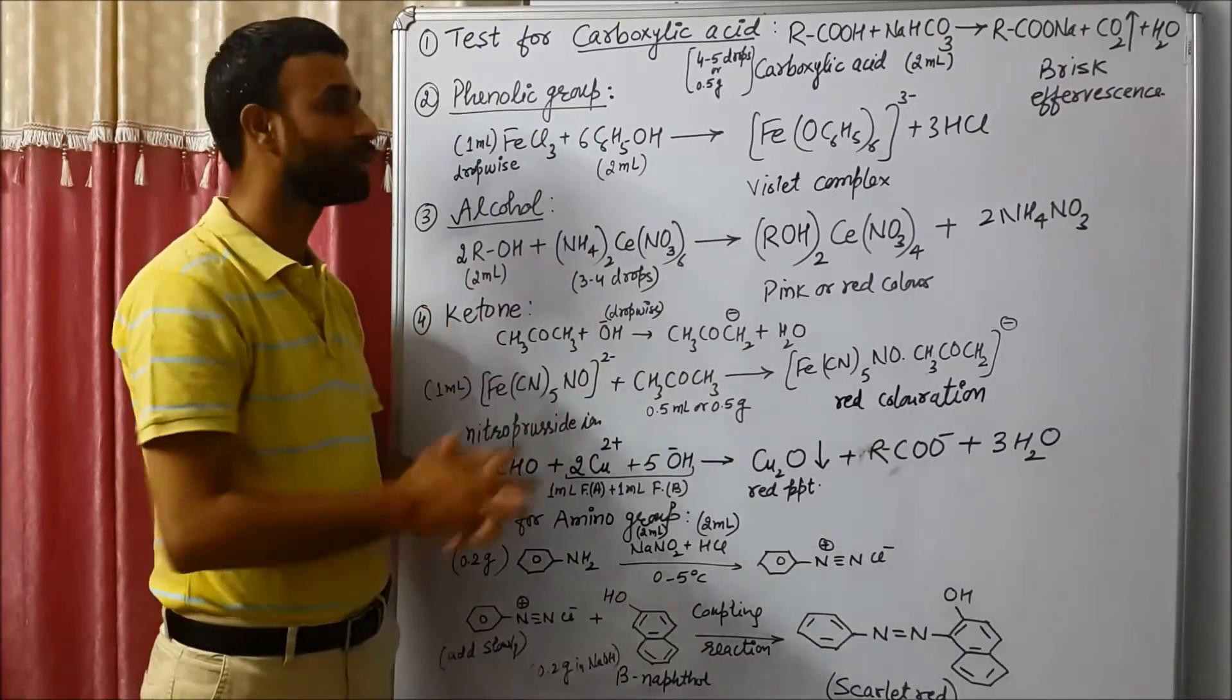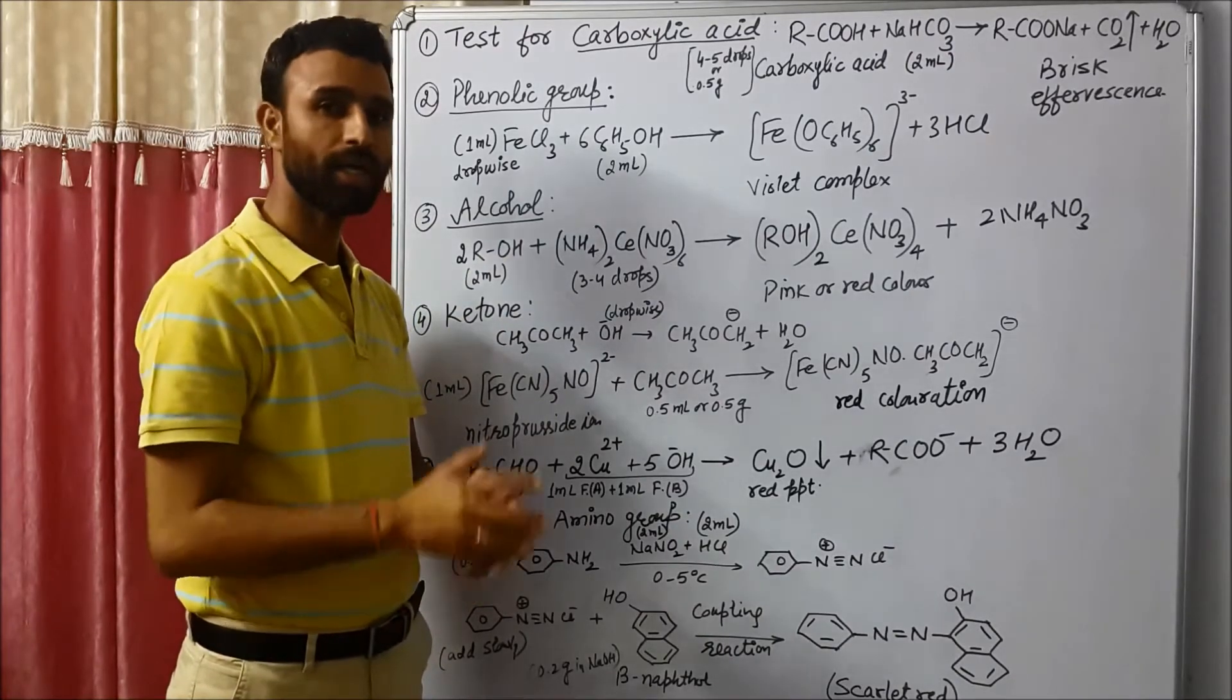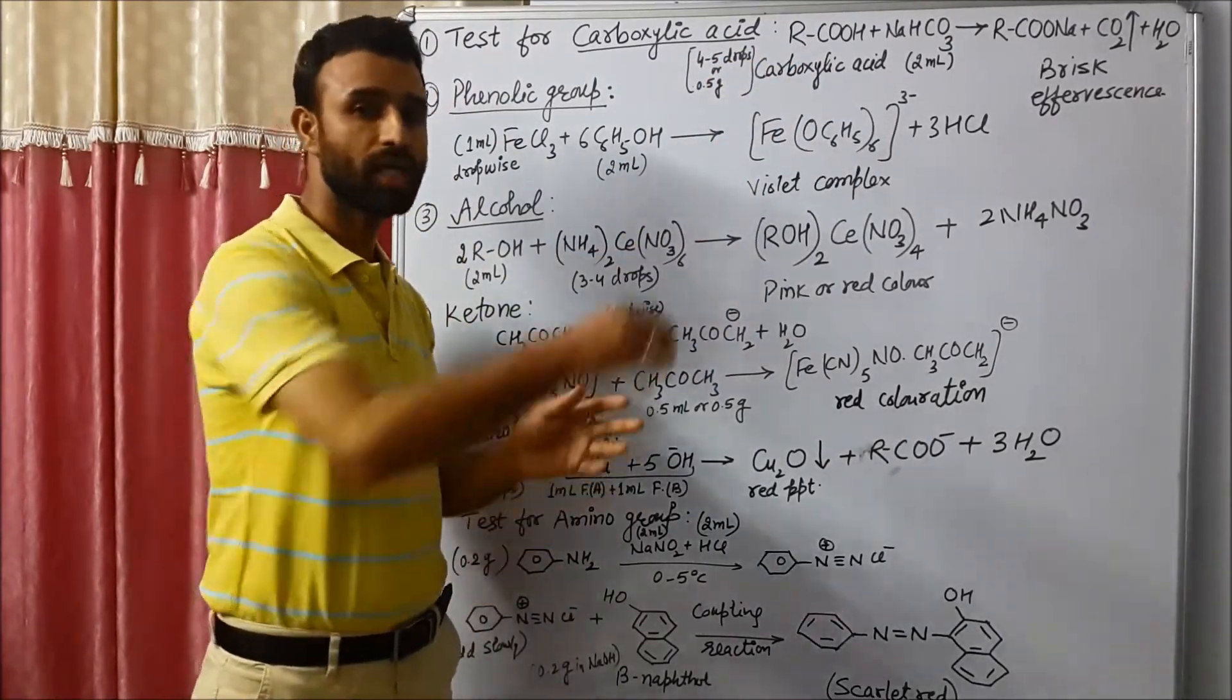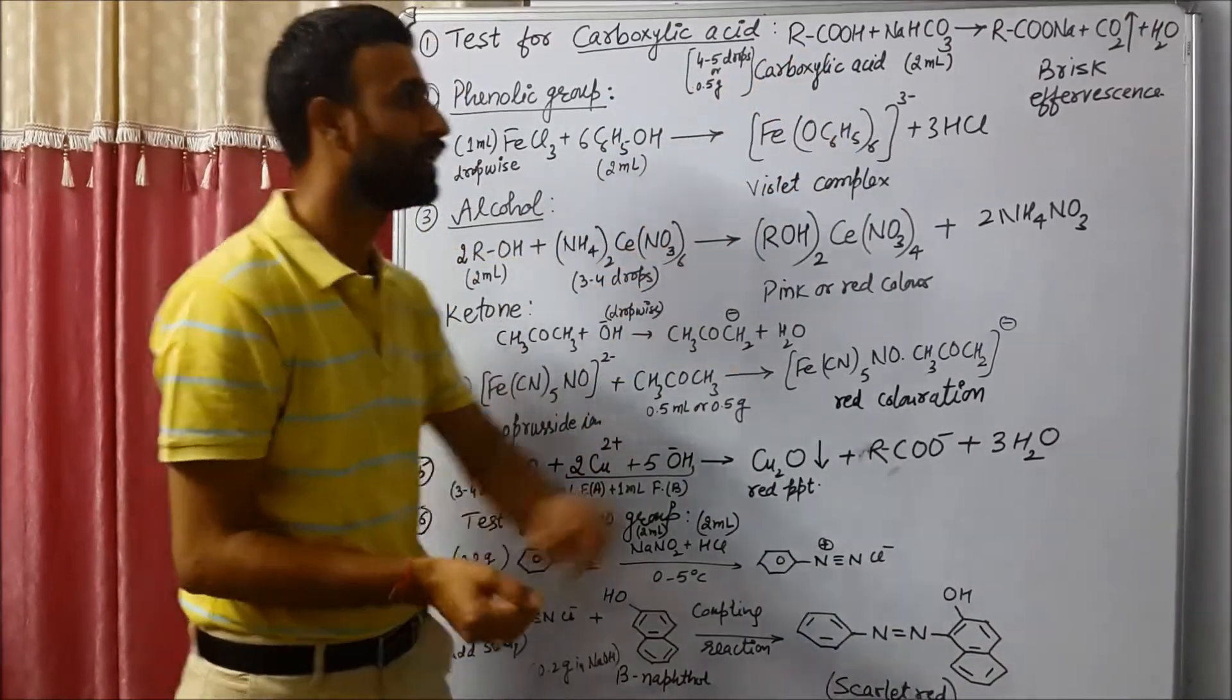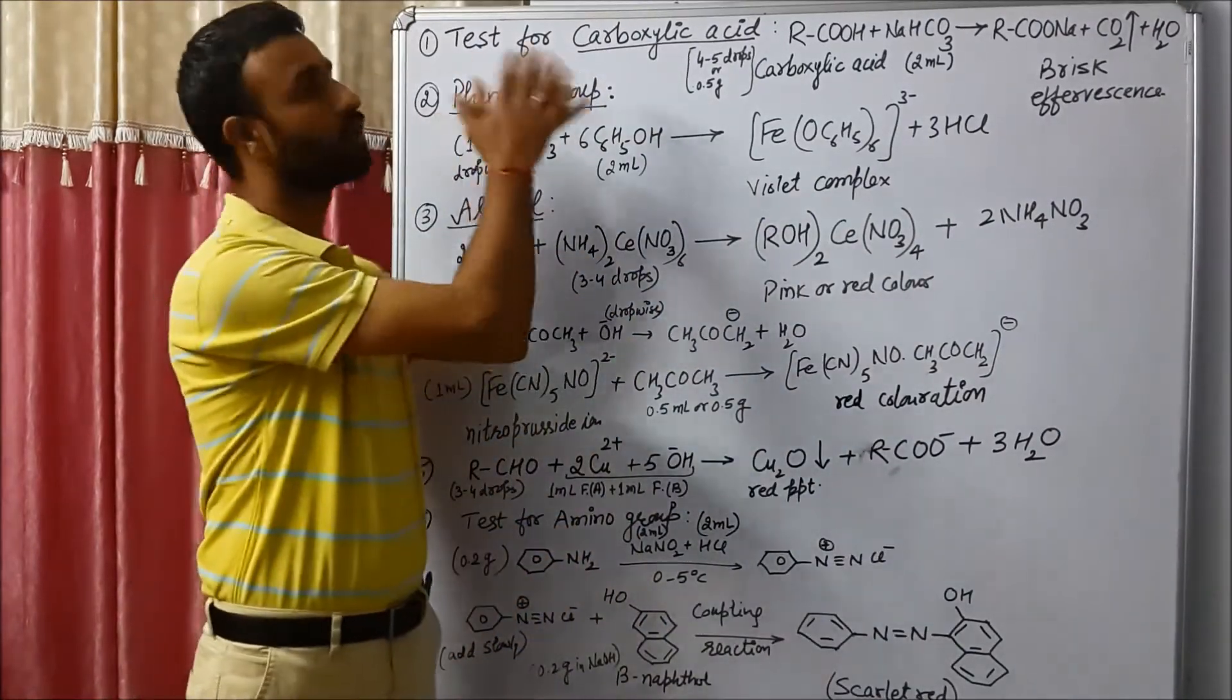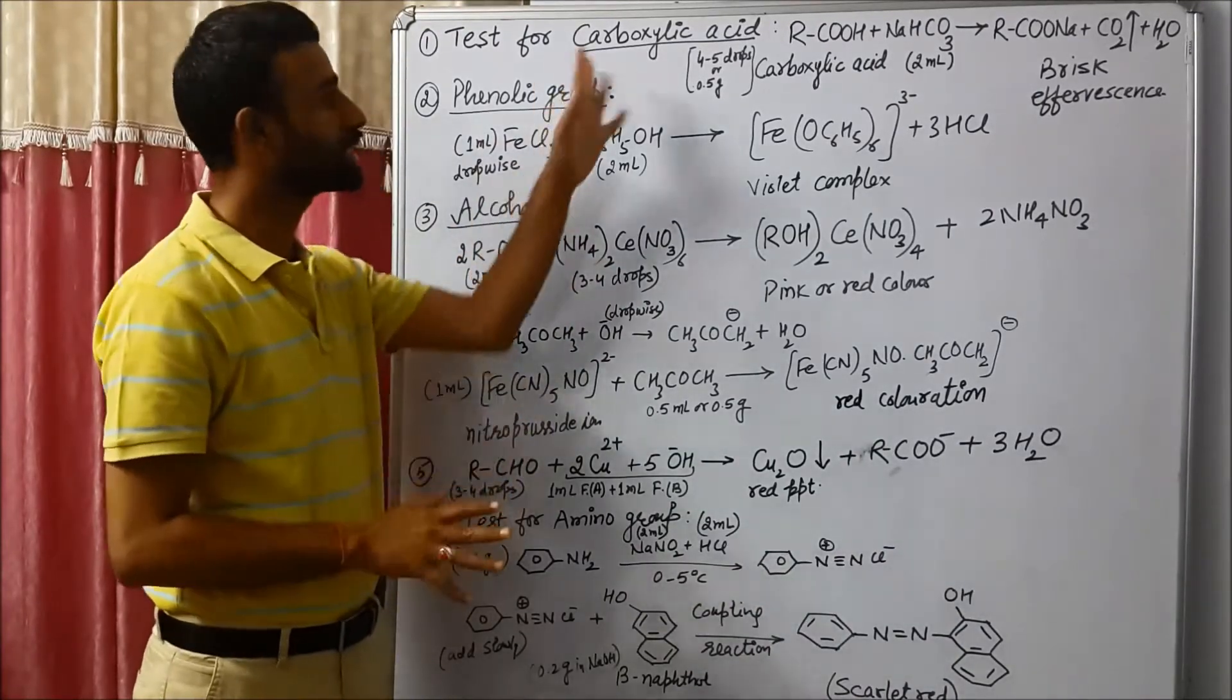So to confirm it, what we do, we take 2 ml of sodium hydrogen carbonate aqueous solution and in that we add 4 to 5 drops of carboxylic acid. So as we add the carboxylic acid drop-wise, we see, if we see this brisk effervescence, that is due to the evolution of carbon dioxide. That means our carboxylic acid is present. So this is first test.